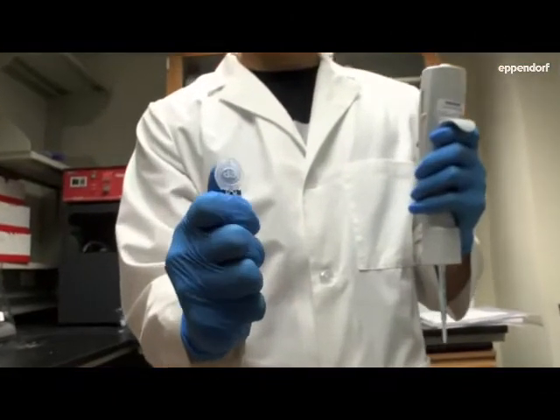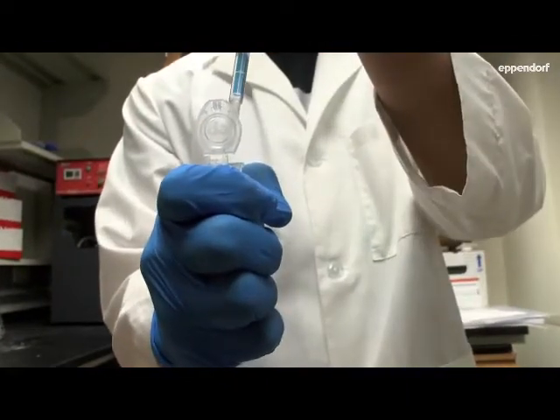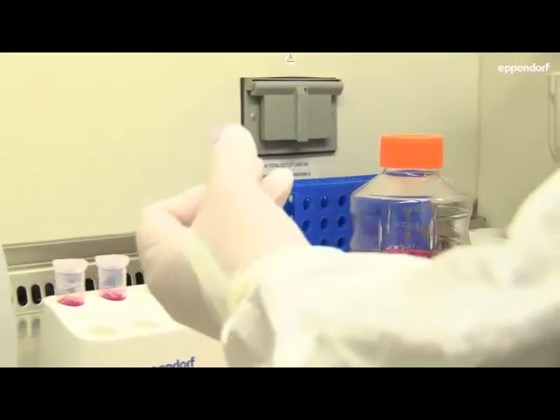One of the things that makes using the five mil tube easier is the snap cap — I'm able to just manipulate it with one hand. It's really easy to open, and when I needed to invert it, it's not going to come open at all.